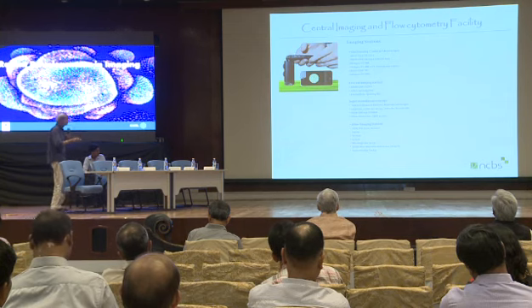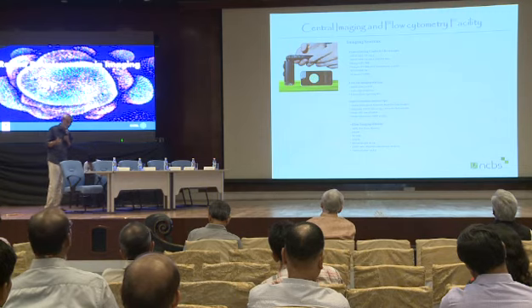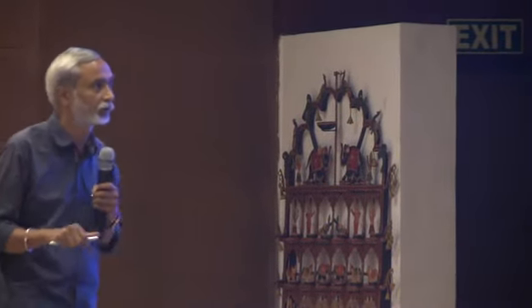We also have a 7-laser TIRF system, which is only the second system in the world. The first one is in Kyoto University. We could set that up with the help of Nikon and also Kyoto University, Aki Kusumi's lab. They helped us in setting up that 7-laser system. Next slide. We also have many cytometers, about 6 analyzers and 4 cell sorters right now in our facility.